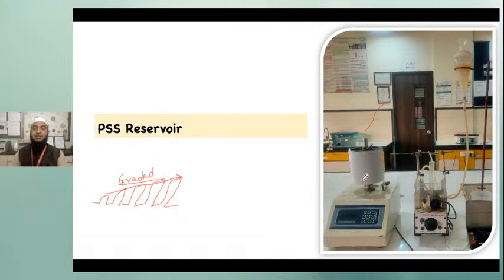To summarize, it consists of a digital rotating drum. It consists of the student organ bath or tissue organ bath, which has an outer covering to keep the water. It consists of the thermostat to maintain body temperature at 37 degrees Celsius. It also consists of an internal organ tube where you are immersing the tissue in presence of physiological salt solution. Next we have seen the lever. We are using a frontal writing lever. What is the nature of the lever here? It is isotonic in nature. So I am done with the first part of the session.